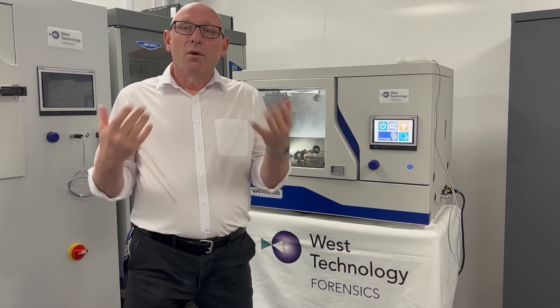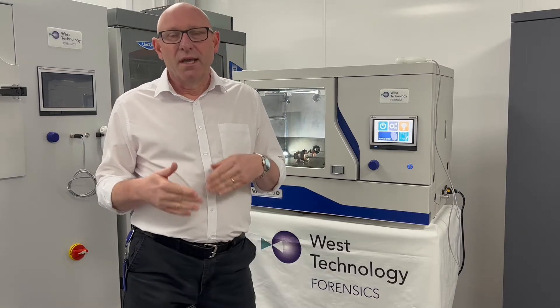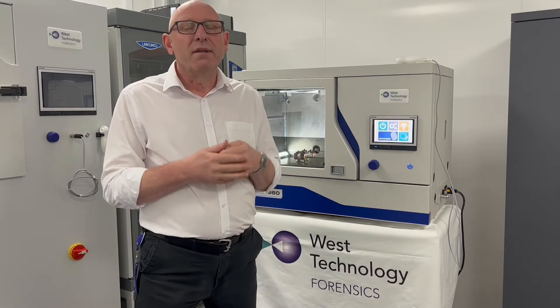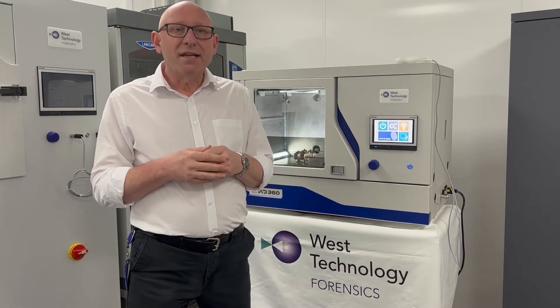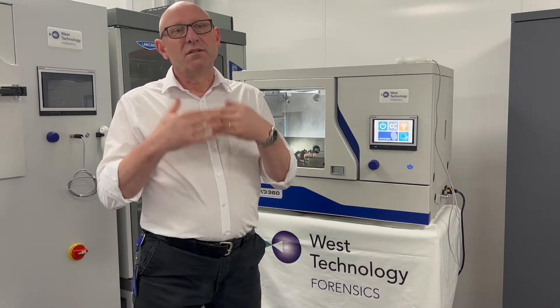So what is VMD? What does it stand for? VMD stands for vacuum metal deposition. What it's doing is laying down very thin layers of metal onto your exhibit to develop the latent prints there.